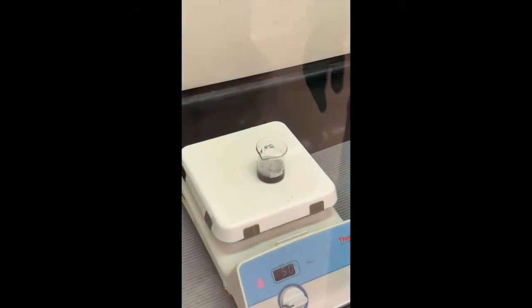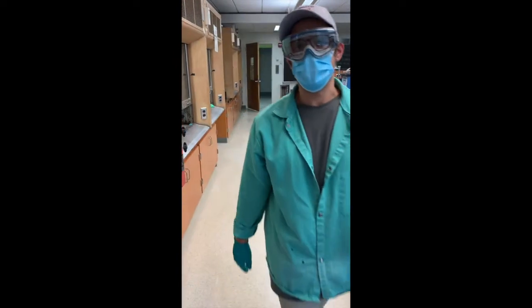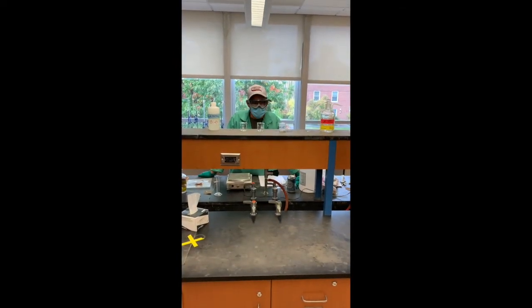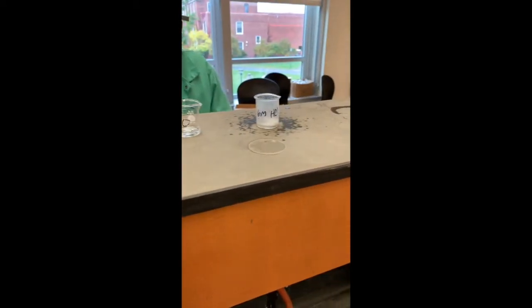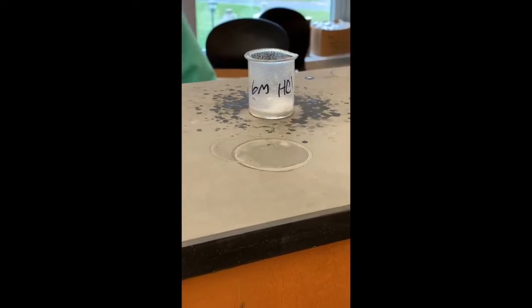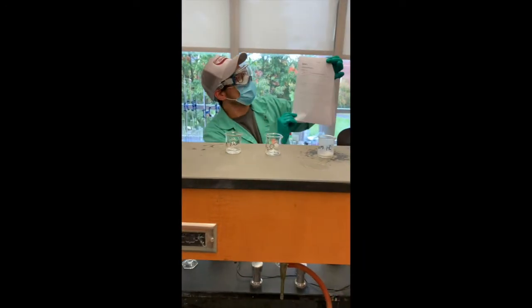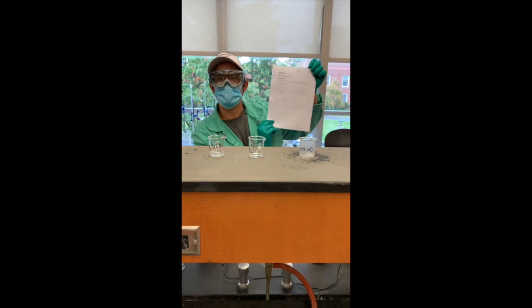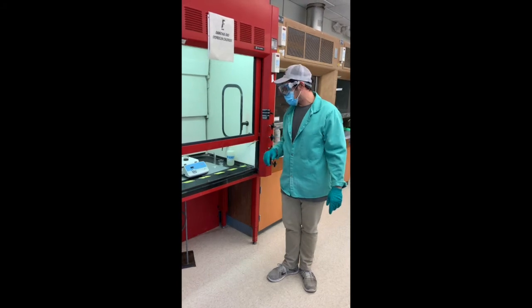Here we can see that the reaction is getting definitely more vigorous as the potassium hydroxide attacks that aluminum. We're going to leave this for a little bit longer, and then we'll move on to the gravity filtration, step 5. Checking back in with our reactions, we can see we got some stuff going on here. Make sure to record your observations in the results section, and this is on page 4. Since we have the potassium hydroxide in excess, the reaction will eventually stop, which just happened.